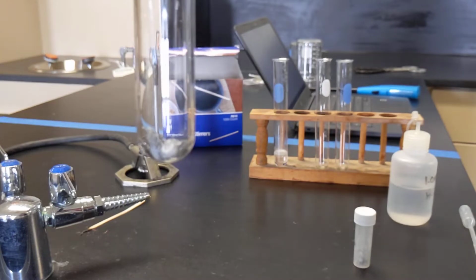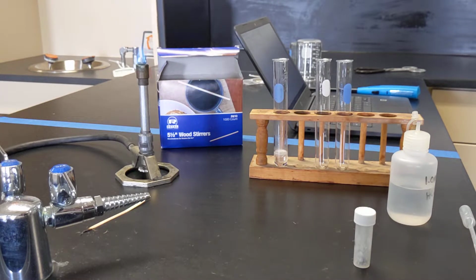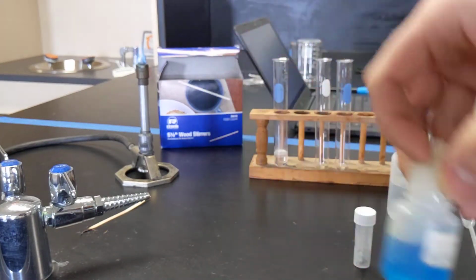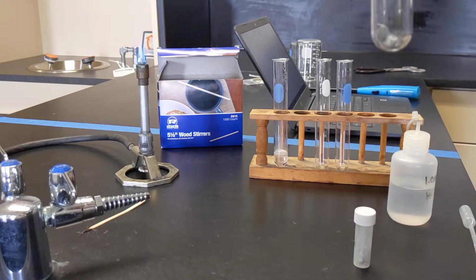If I bring it in closer than that, it gets out of focus, so that's about my limit. Okay, and then the copper 2 chloride is this blue liquid. I'll add that in there, and we will see what, if anything, happens.